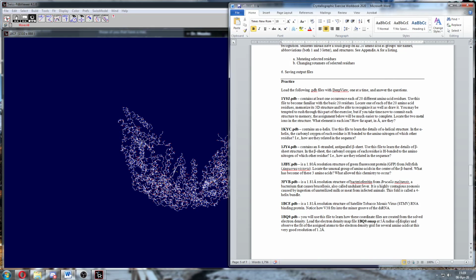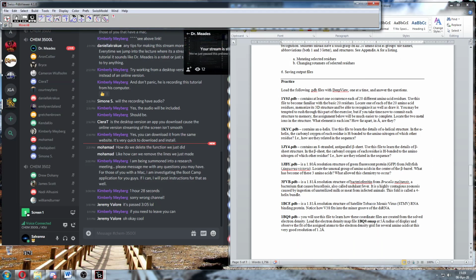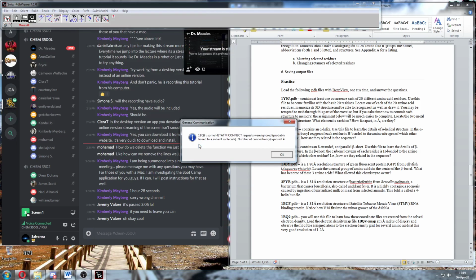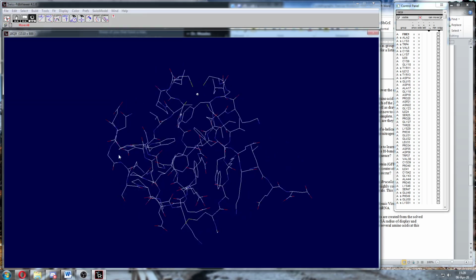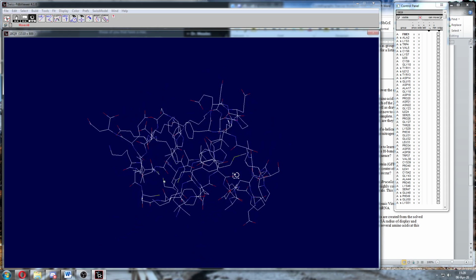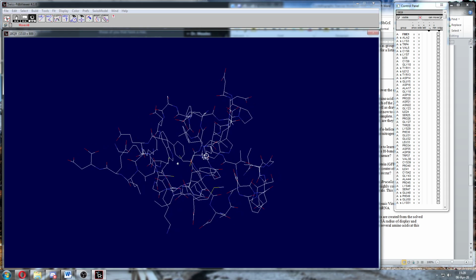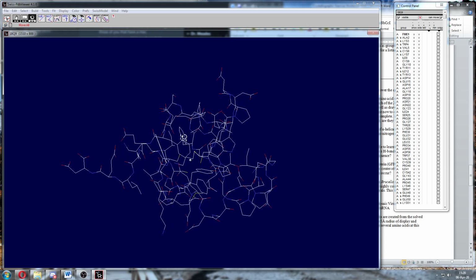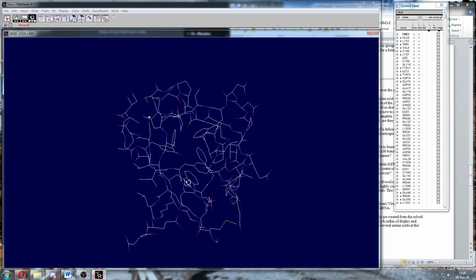Okay, all right, lastly, we want to open 1BQ9. Close this, open 1BQ9. It's a rather small protein. If you notice in the very center, there's a high abundance of rings. You've got tyrosine here, tryptophan there, phenylalanine here, another tryptophan over here. Lots of ring structures in the center.